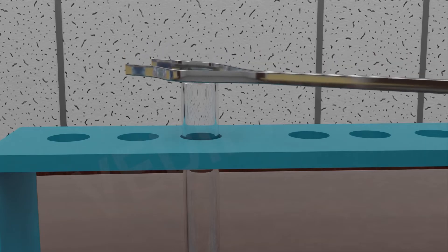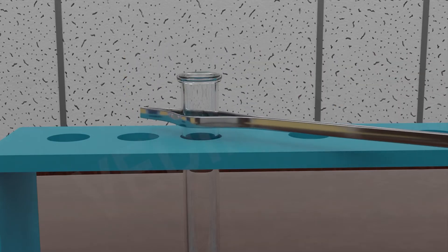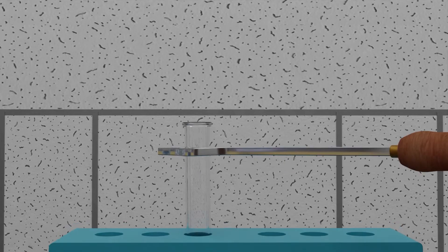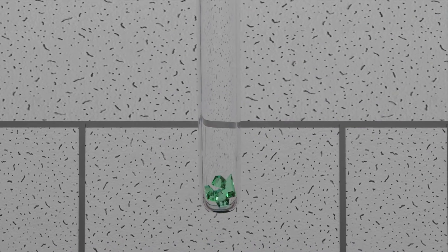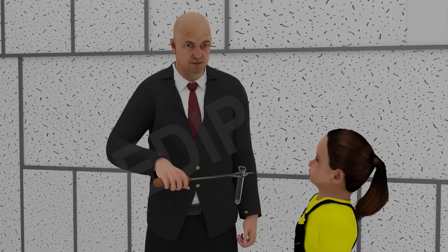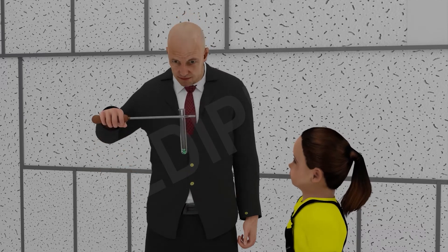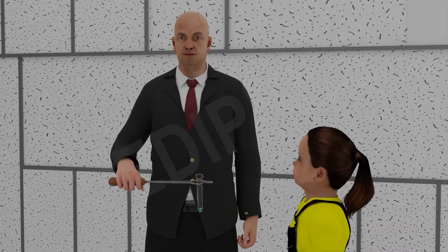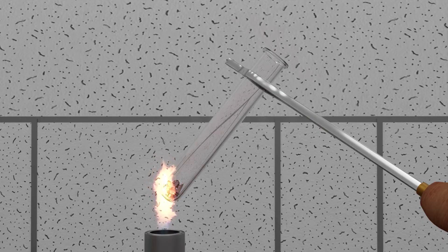Now let's heat this tube. But remember, do not point the mouth of the boiling tube at your neighbor, friends, or yourself. Now observe the color of the crystal after heating.